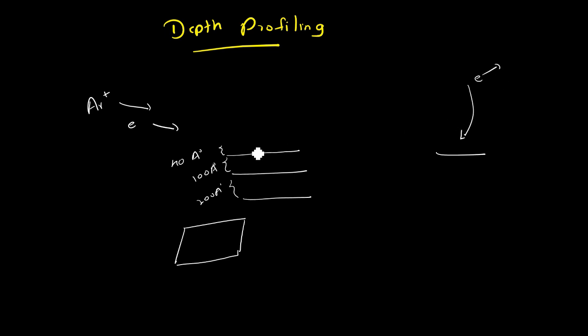So now this Auger process happens in this layer. It's not the surface, it's in the depth. We have peeled off the surface. So now we can have the data about the 40 angstrom depth composition, and after the analysis we stop the electron bombardment.